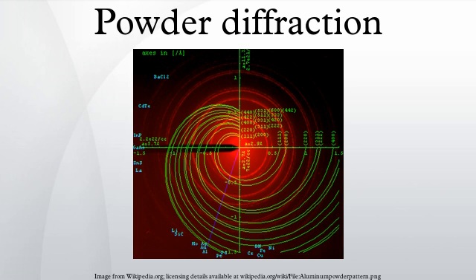An instrument dedicated to performing powder measurements is called a powder diffractometer. Uses: relative to other methods of analysis, powder diffraction allows for rapid, non-destructive analysis of multi-component mixtures without the need for extensive sample preparation. This gives laboratories around the world the ability to quickly analyze unknown materials and perform materials characterization in such fields as metallurgy, mineralogy, forensic science, archaeology, condensed matter physics, and the biological and pharmaceutical sciences.